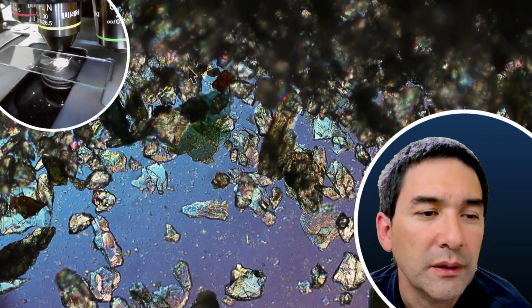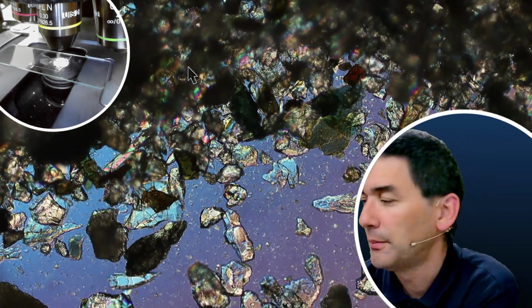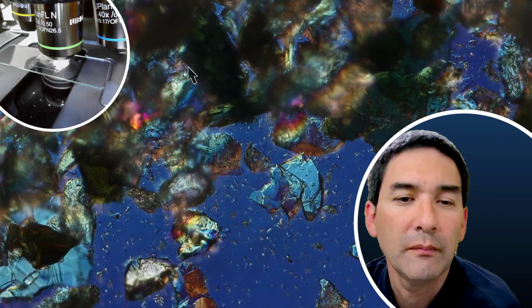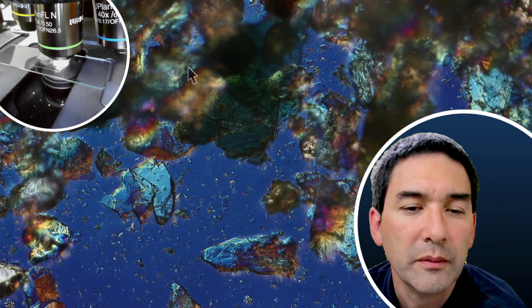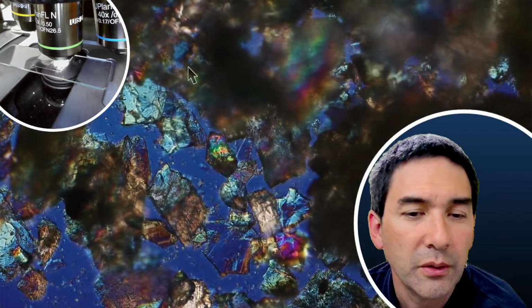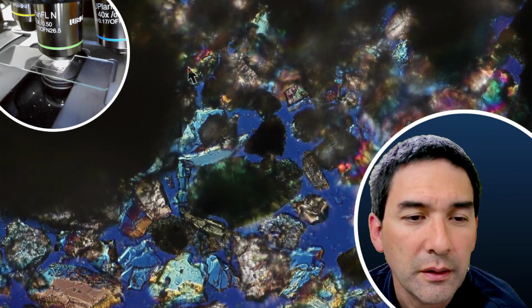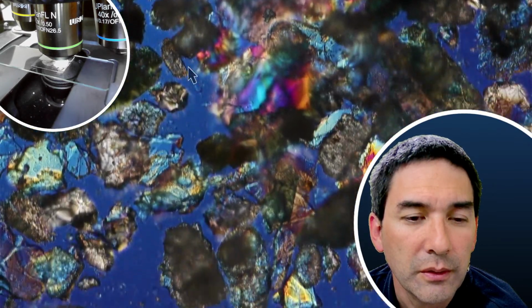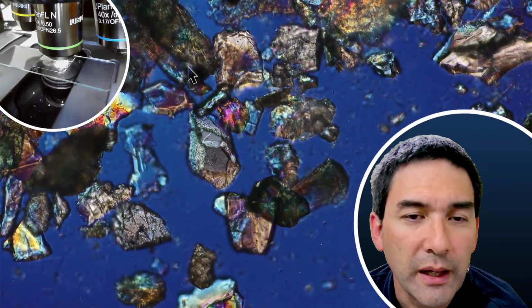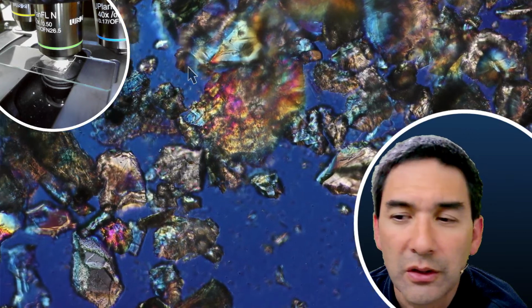I actually think this looks quite pretty. But let's go up with the magnification some more. Usually, it's also mostly sand grains, inorganic material, and because I'm using polarized light right now, of course they look quite nice and colorful.